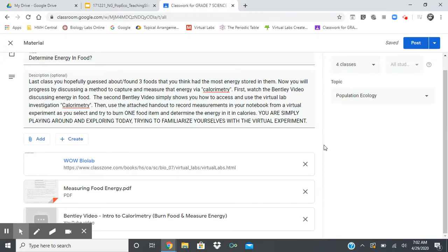All right, guys, I know it seems kind of overwhelming, but a second Bentley video. This one I'm just going to show you really quickly how to access the virtual activity we're going to be using for calorimetry. I want to go real quickly through how to access this lab here so that you can burn foods, different kinds of foods, virtually, of course.